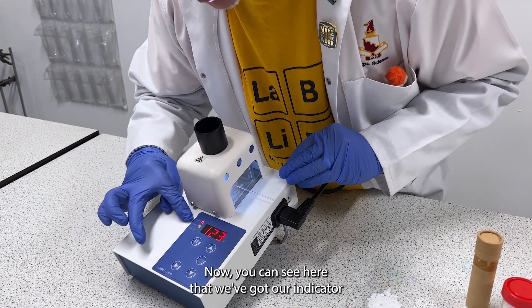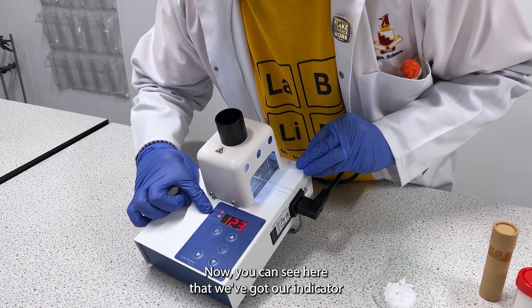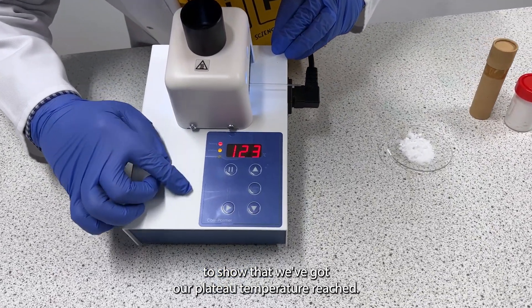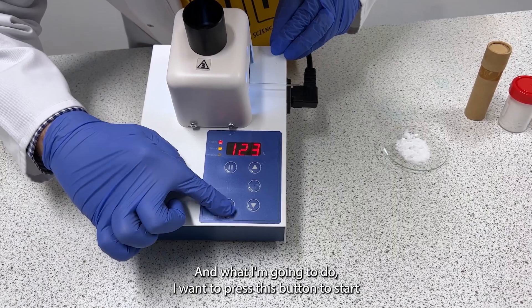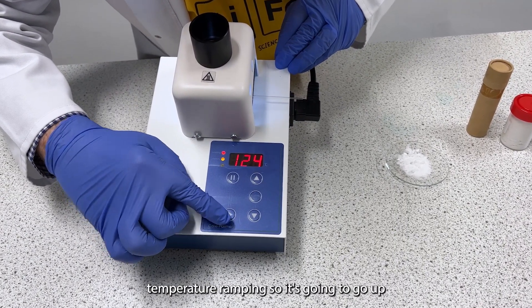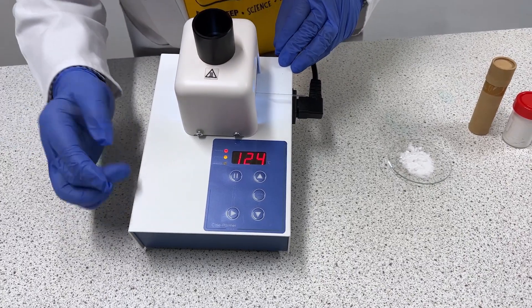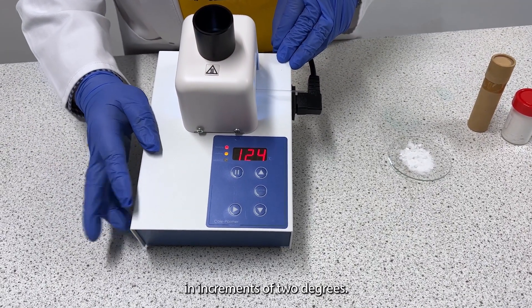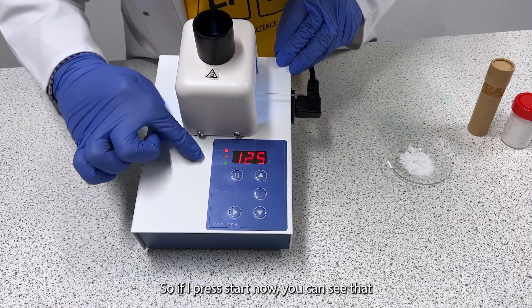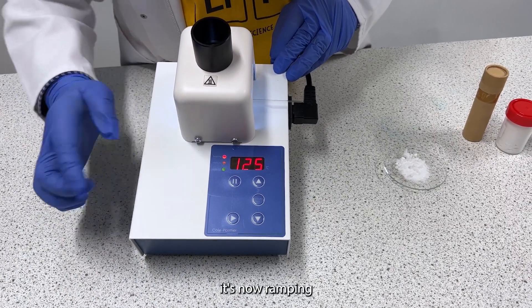Now you can see here that we've got our indicators to show that we've got our plateau temperature reached, and what I'm going to do is press this button to start temperature ramping. It's going to go up in increments of two degrees, so if I press start now you can see that it's now ramping.